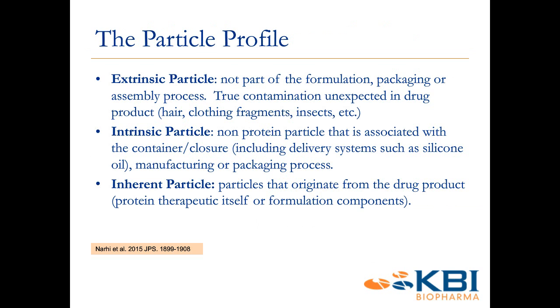When we look at particles forming in this aspect, they're generally related to more inherent or intrinsic material. As I mentioned, one of the ones we are most interested in is observing the protein or active product forming particles, but certainly particles could be forming from other excipients in the material. They could be coming from your container closure, or they could be truly extrinsic material, material that you do not want in your product, such as hair, clothing, insect parts, etc. So this is the general nomenclature we use for classifying particles within products that we look at.